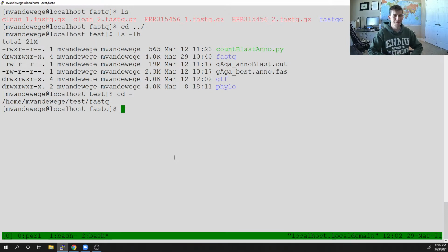The idea is reasonably simple: find overlapping reads that share sequence similarity and build a contig from that, a contiguous sequence of reads that overlap with one another and produce a transcript.